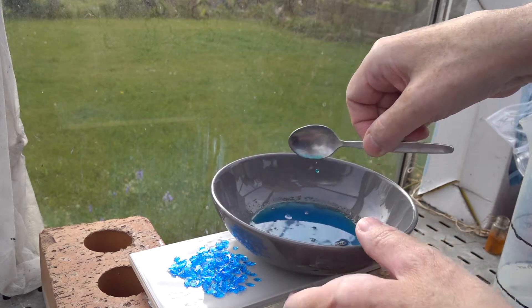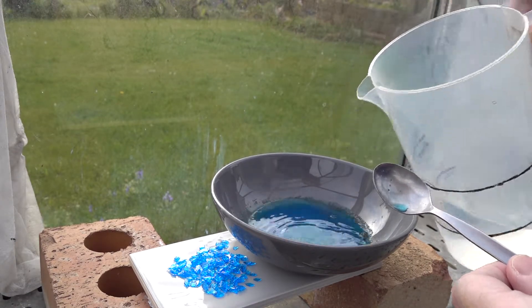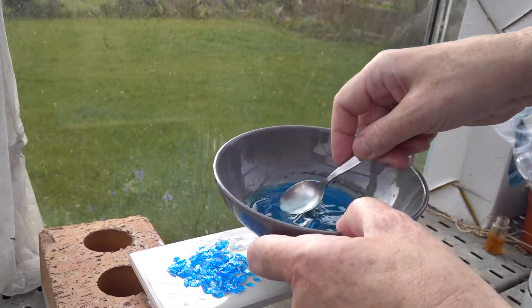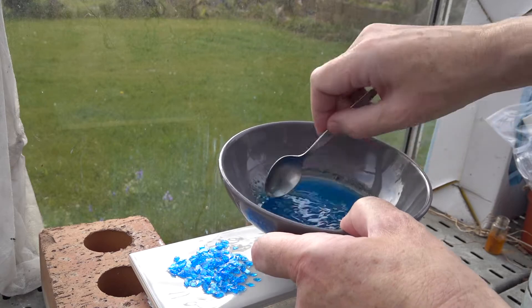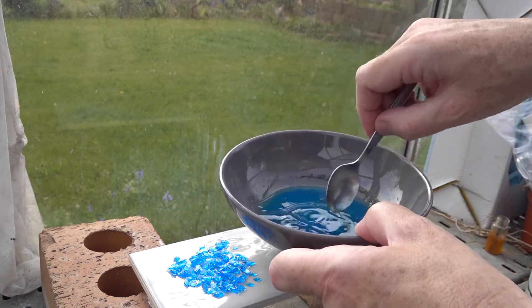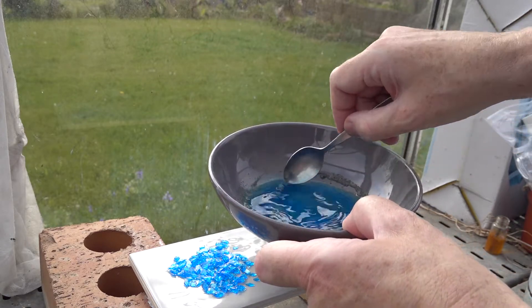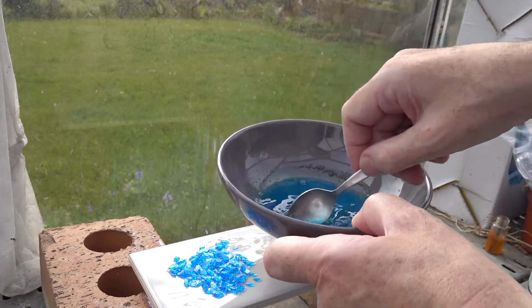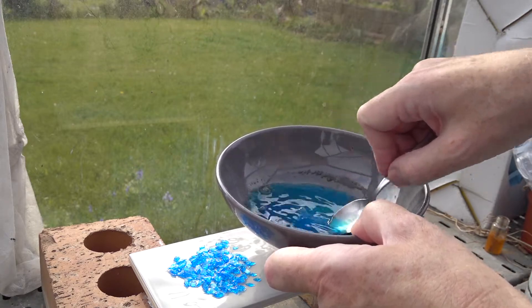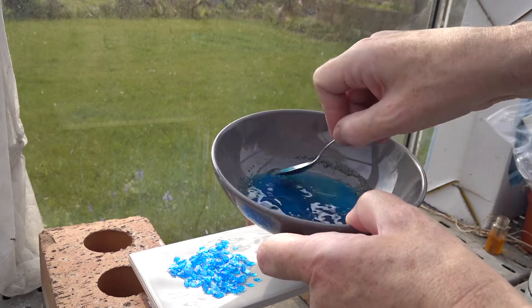We probably need a little bit more of the hot water. My water has in fact cooled down a little — you should probably use near to boiling water. In fact, you can heat to close to boiling to increase the solubility and make the copper sulfate dissolve faster.